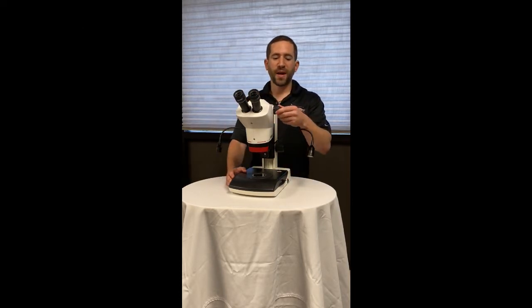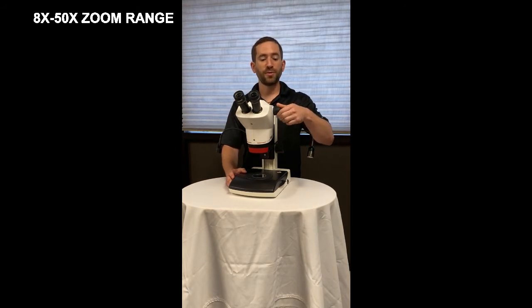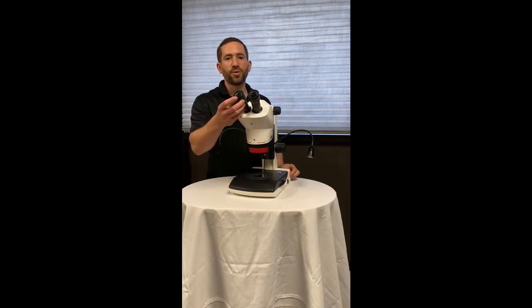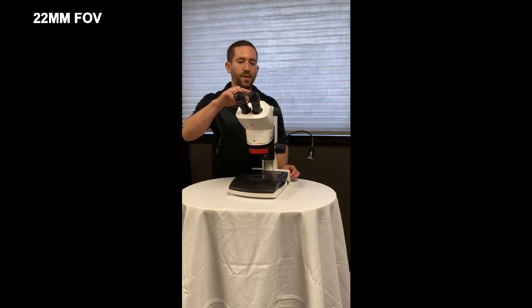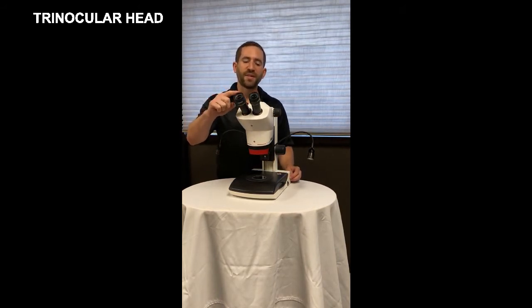The microscope has a large 8x to 50x zoom range with large easy-to-use zoom knobs. The eyepieces are both focusable and offer a large 22mm field of view. The trinocular head allows for simultaneous viewing through the eyepieces and the camera.